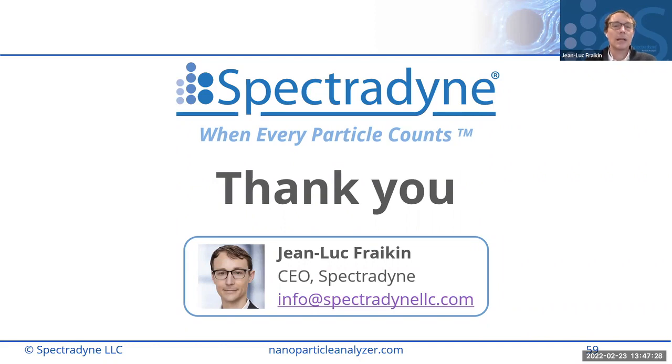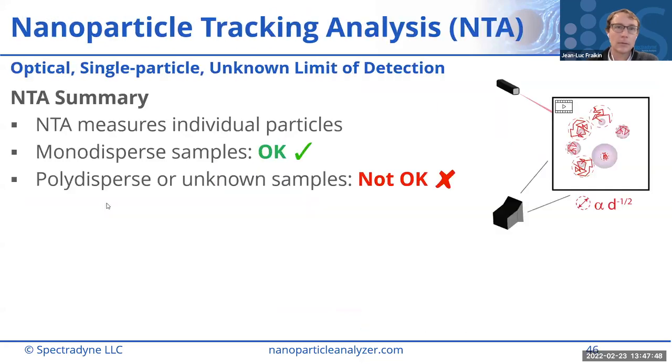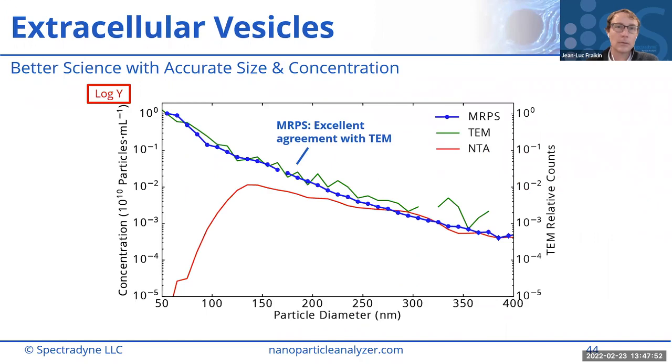I'm not sure I understand your question exactly. So you're talking about real data that you've measured on the NCS1, and you're asking about a peak right near the noise floor of the cartridge, is that right? No, I'm asking about the pictures you included in your presentation today. Some of them have the peaks at 65 nanometers, right? And I'm just curious for the standards that, right, so here is hard to say.